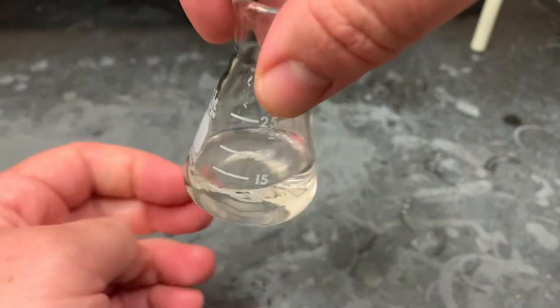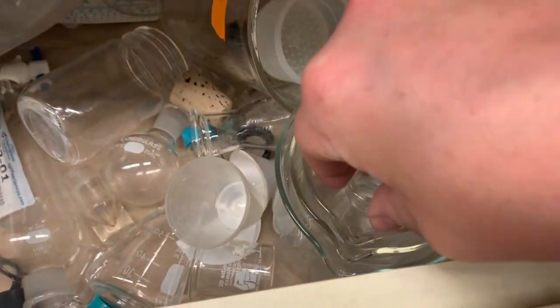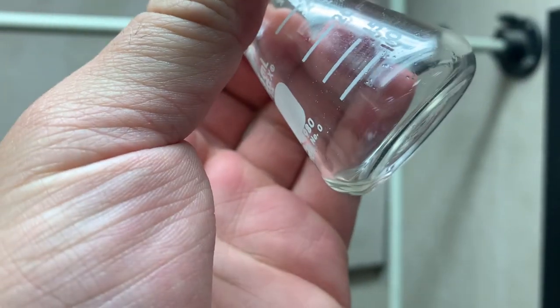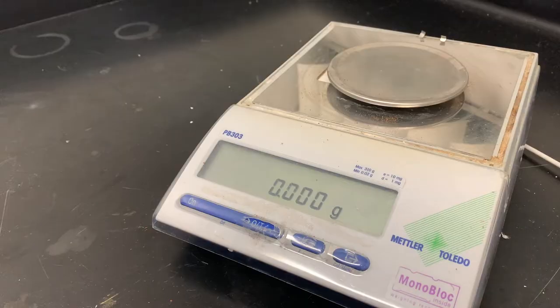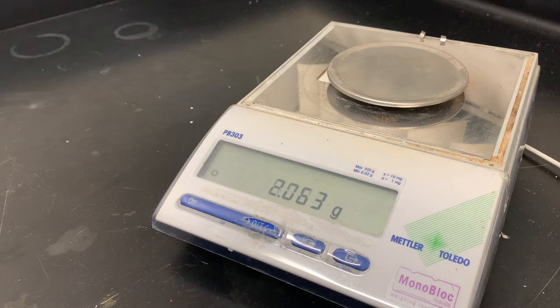You're going to take this and you can either boil it down with a boiling chip or leave that open in your drawer to evaporate until next time. And by next time, it should look something like this. So a week later, or after you boil it down, it looks like this kind of thin oil, maybe a little thicker, maybe yellow, maybe clear. Then after you've got that, we're going to weigh it, and now take it to a GC.